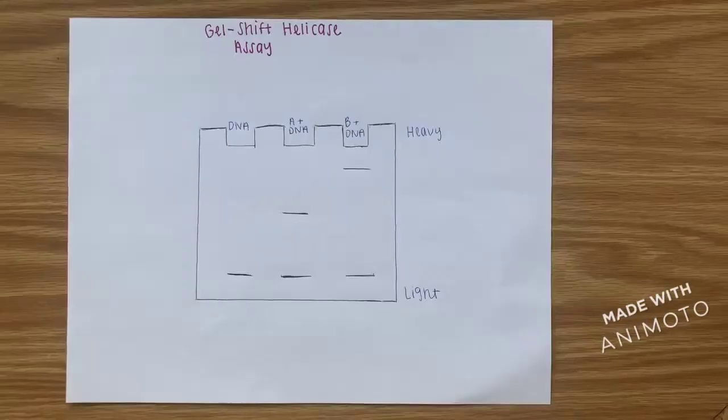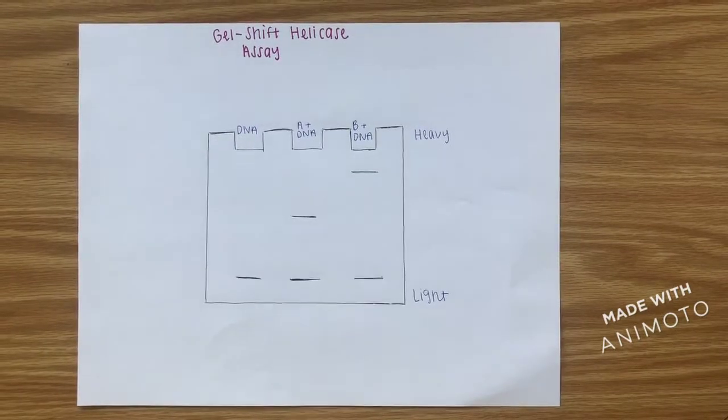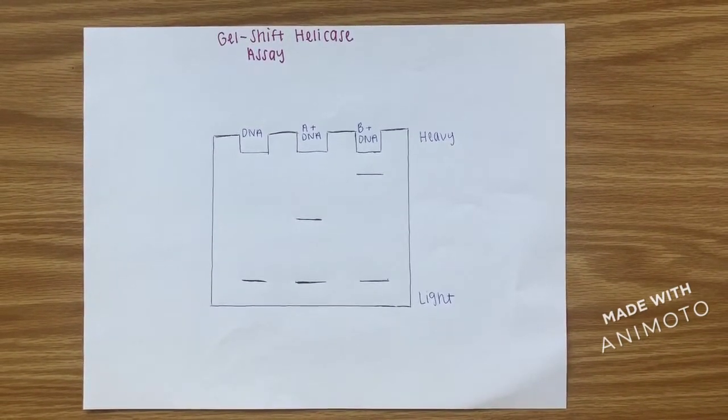Problem is, ours never seem to come out right, so we're going to use some basic examples to show the analysis. This is our representation of a completed gel. The columns are based on each well that was filled. The lightest molecules go to the bottom while the heavier molecules stay on top.